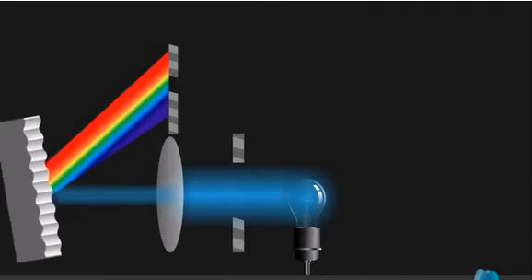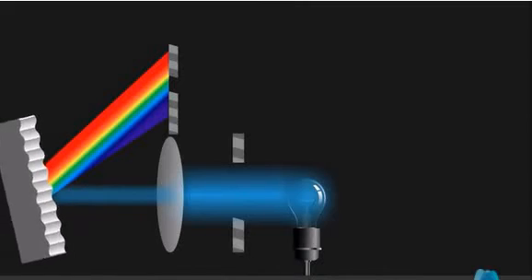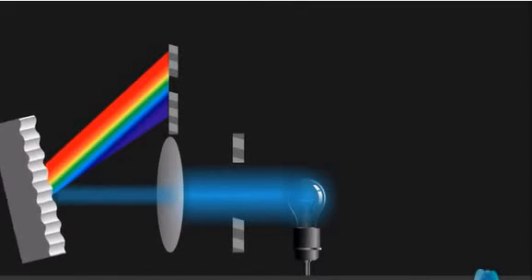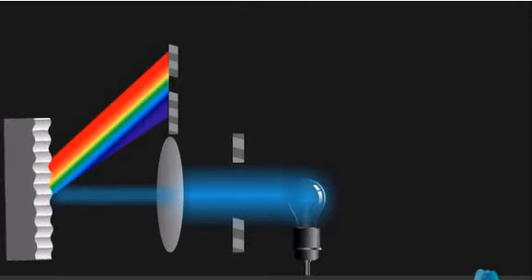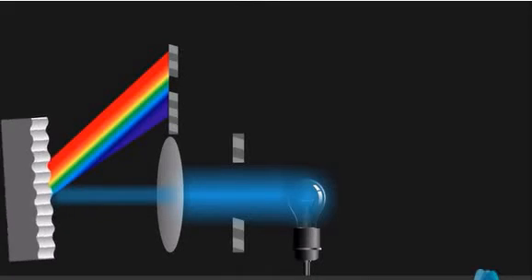Gratings are an alternative to prisms and an advanced version of the prism, because on the surface of a grating many small, tiny prisms are present. In 1 mm area there are 1200 to 1400 small groove-like structures, and each groove acts as a prism.